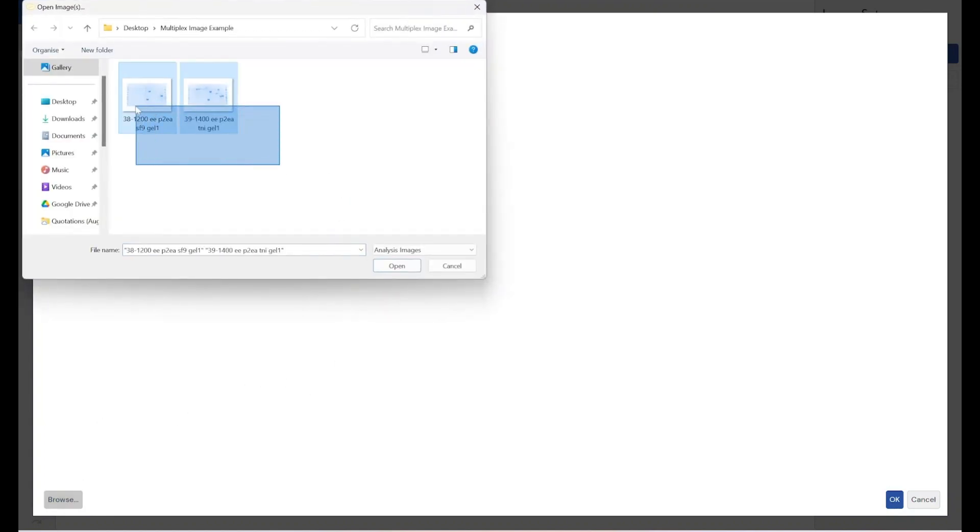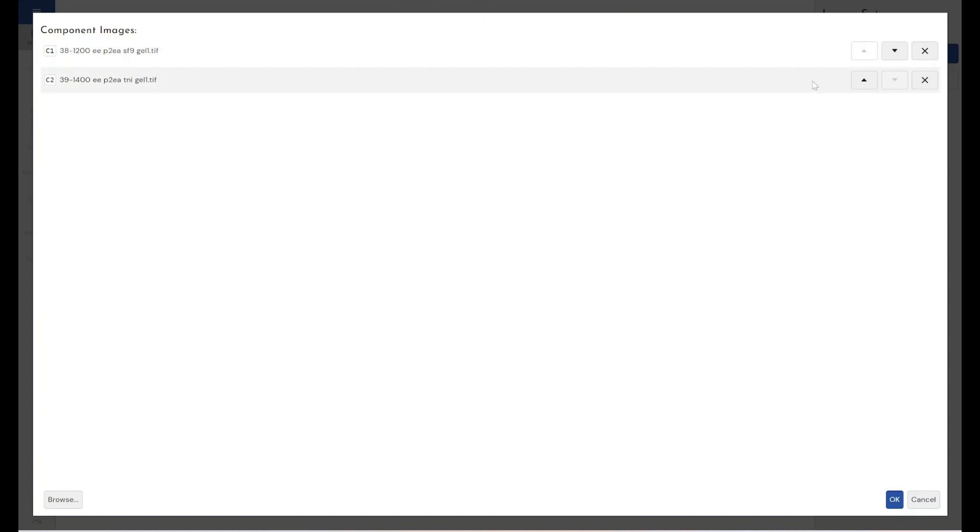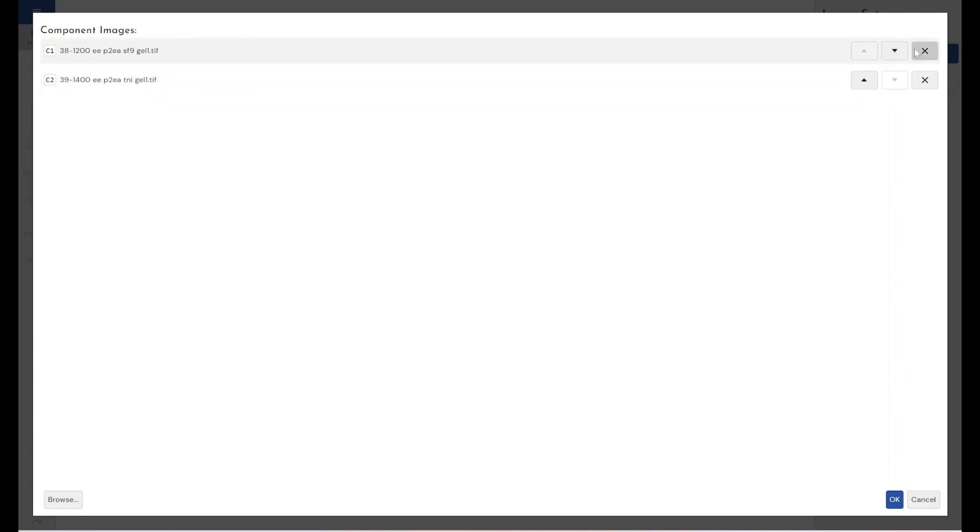So I'm just going to grab these two images and from this window we can determine which image we want in which channel. The top image will be in channel 1 and the secondary image will be in channel 2 by default, but you can use these arrows to change the order of the images within the multiplex and you can remove images if you need to go back.